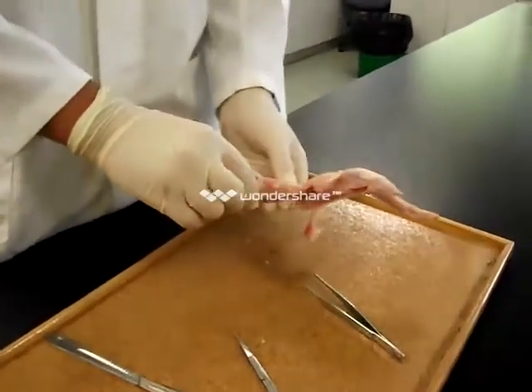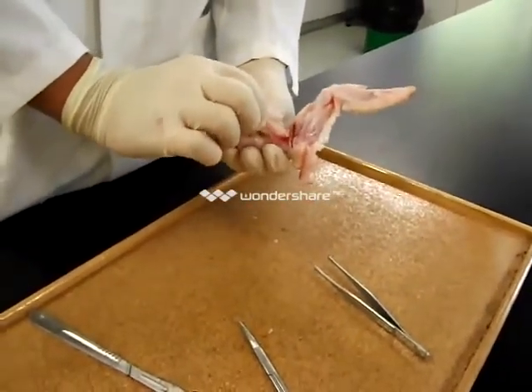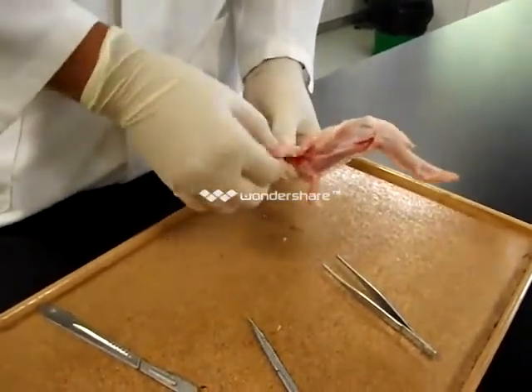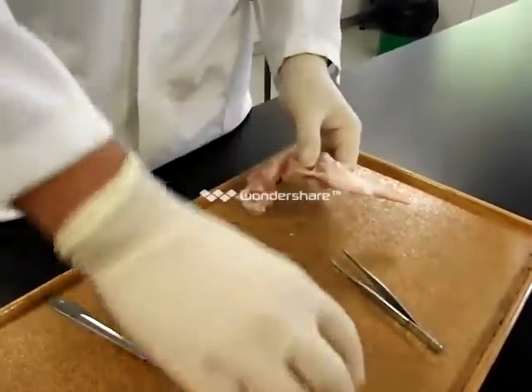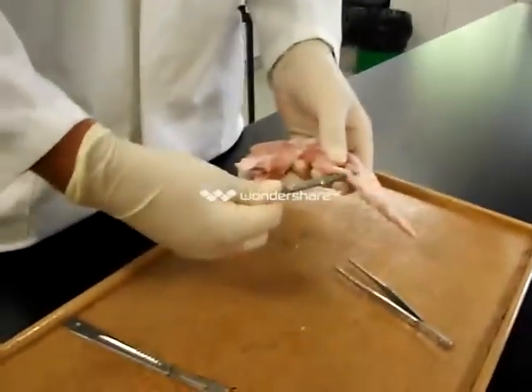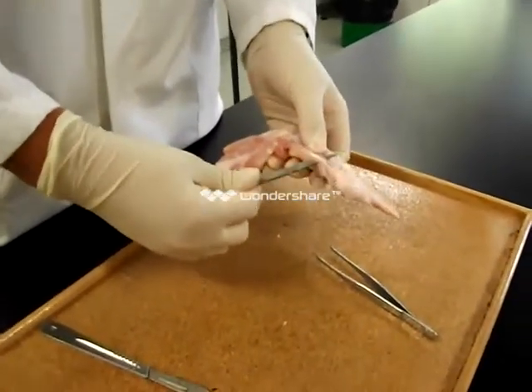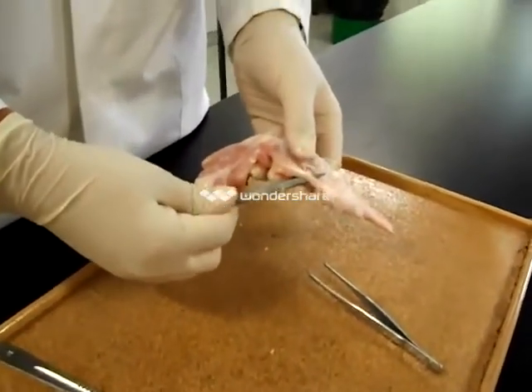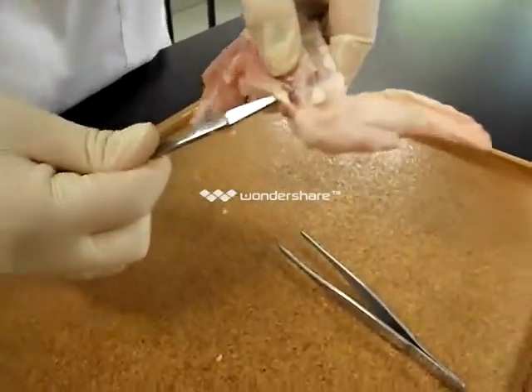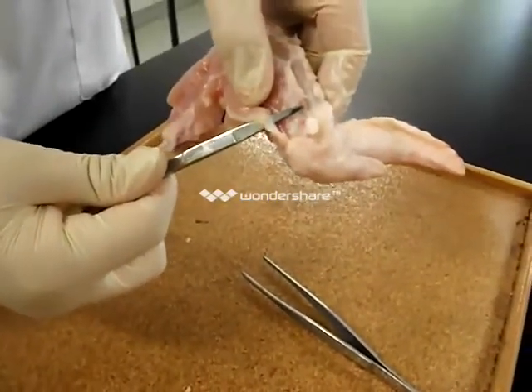Now we are going to zoom in where the bone is attached and the student is going to place the probe underneath the ligament. It can demonstrate — I will try to zoom in. That shiny piece is the tendon that is attached to the bone and there to the muscle.